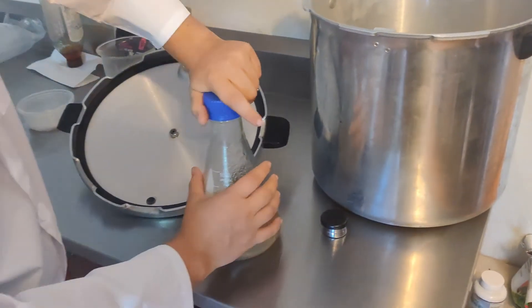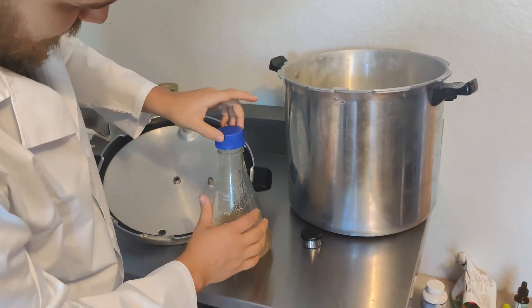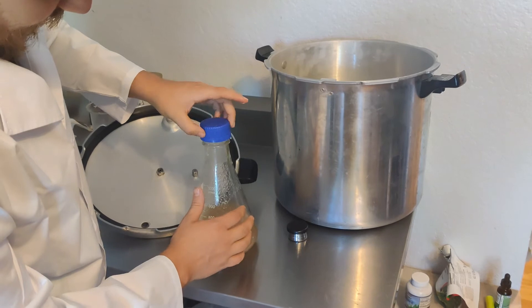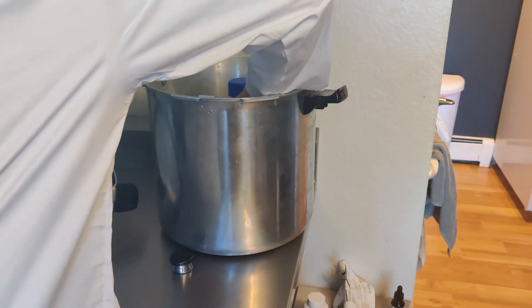One important thing to note is that you don't want your cap to be sealed. Just place the cap on and tighten in a few threads so that it's not sealed, or else you'll have a big mess in the pressure cooker.